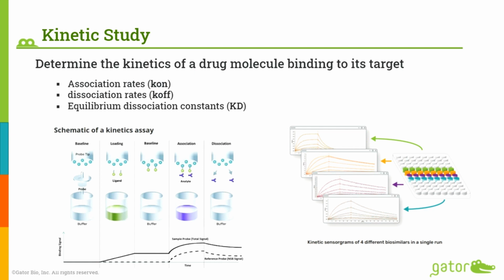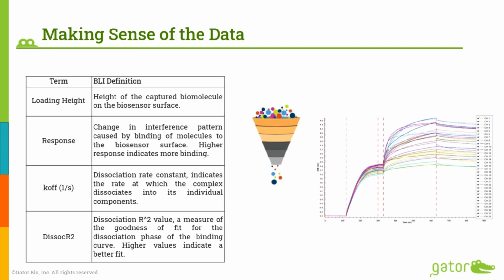So what we do is we set up all the solutions, the antigen, the supernatant, all in a 96 well plate. We have the program automated using our picker. It takes the biosensor from one position to another position. So it goes to baseline, loads the antigen, washes, comes in with the supernatant, which is the association, and we see the dissociation. Right? And then we come in with this huge set of data, because you can imagine almost 3,000 plus data just for doing kinetic screening, right?